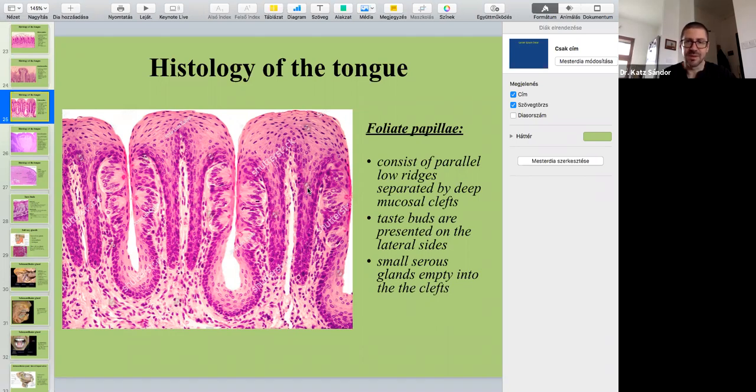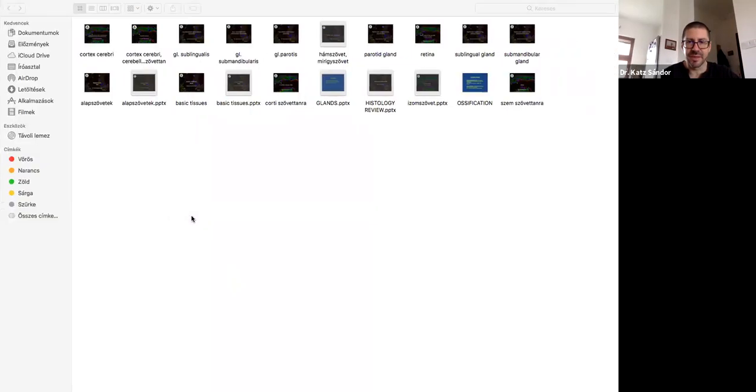There is another aspect. If we just check the surface, we can say it's an M, but here we can see the exact W from the connective tissue side. I think it's beautifully seen. So this is the foliate papilla. For the foliate papilla, we have the number 50.